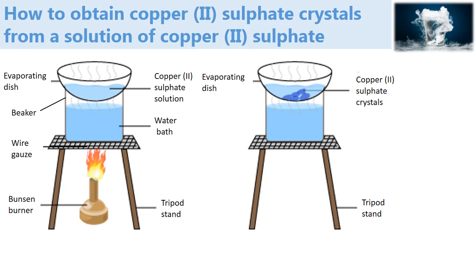The moment crystals start to form, we call that saturated or saturation point.